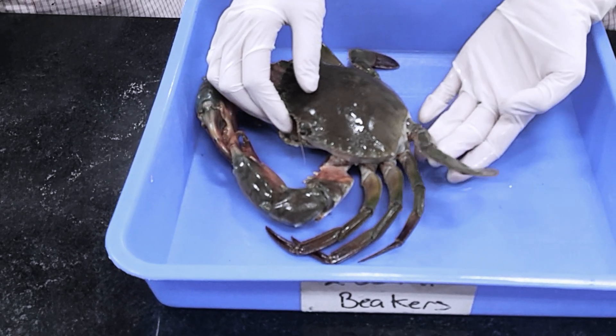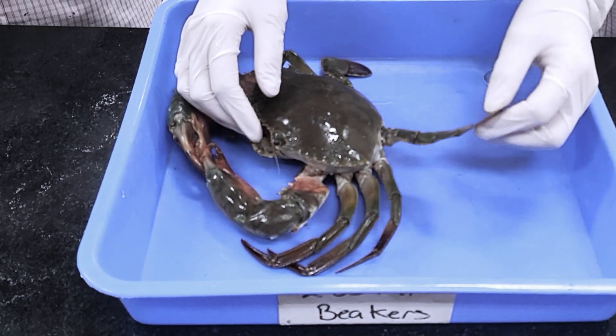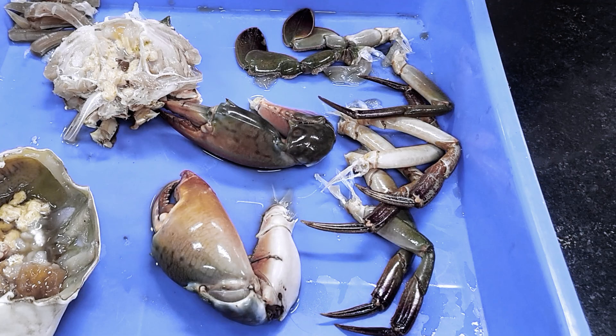Some aquatic crab species have flattened last pairs of pereiopods, allowing them to move faster through the water. They are commonly known as swimming legs. They also have four pairs of legs for both sensing their surroundings and walking.